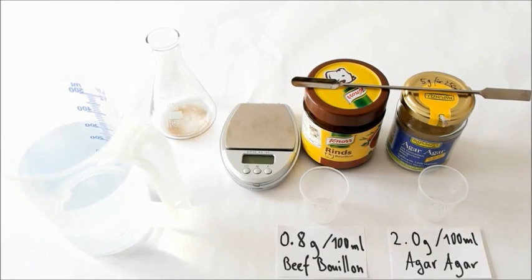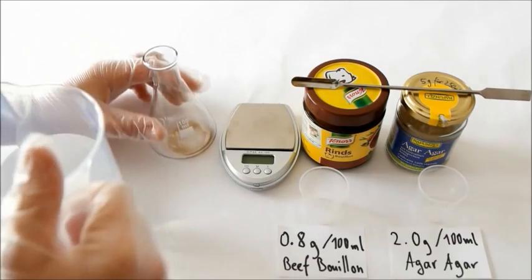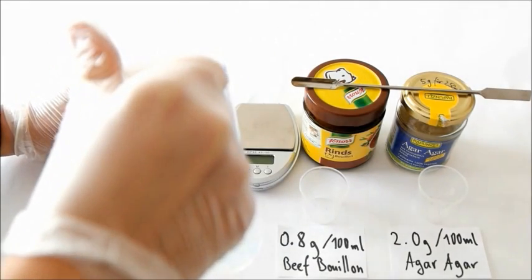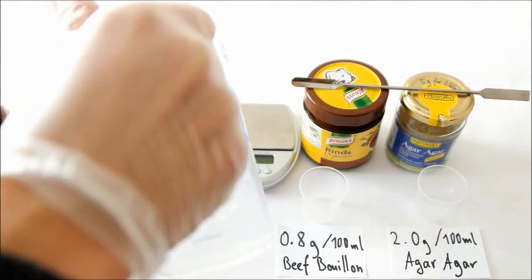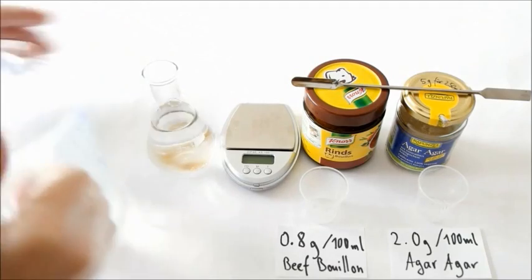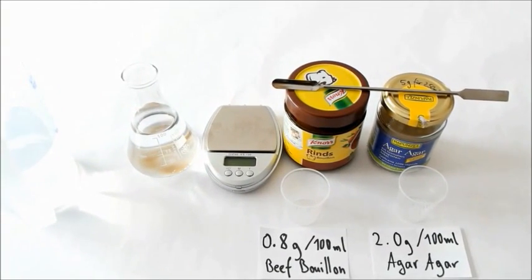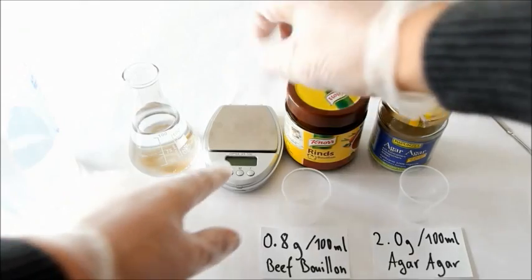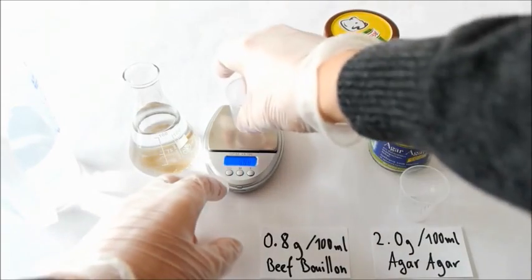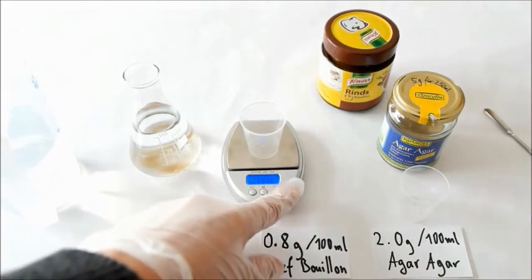First of all put 100 ml of tap water in your Erlenmeyer flask and then measure out your ingredients. You'll need around 0.8 grams of the beef bouillon in 100 ml of water.